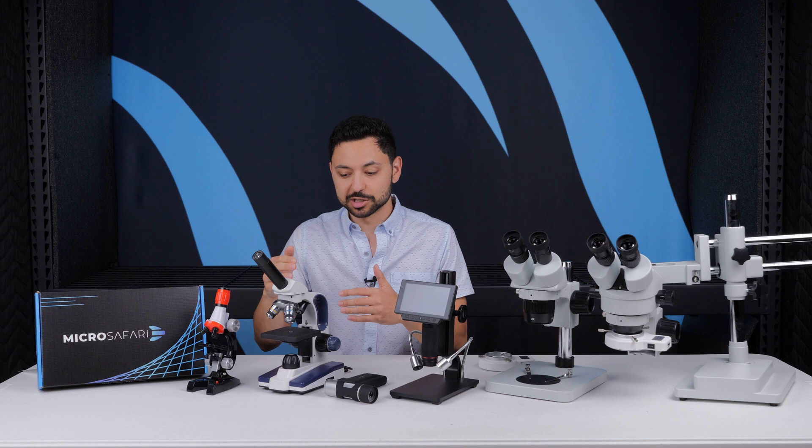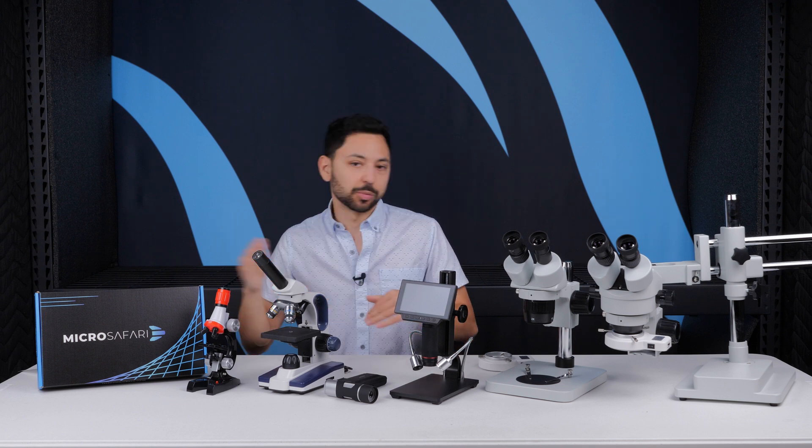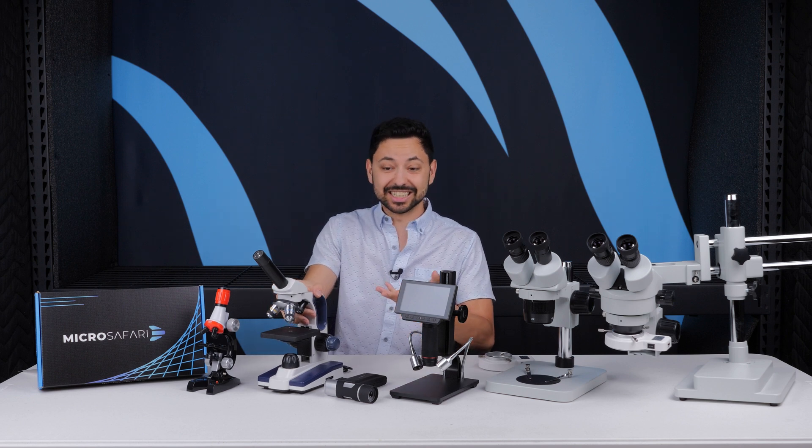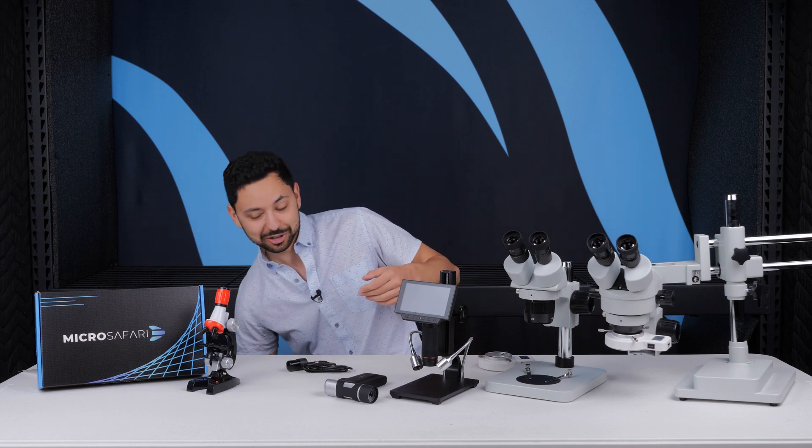Otherwise, the really high magnifications make the entire process of doing microscopy really complicated, and it's going to be hard for kids. So I'm just going to get it out of here so you don't even have to think about it.